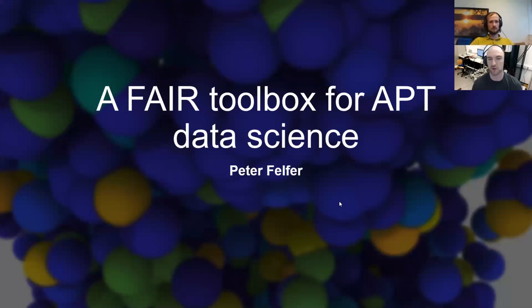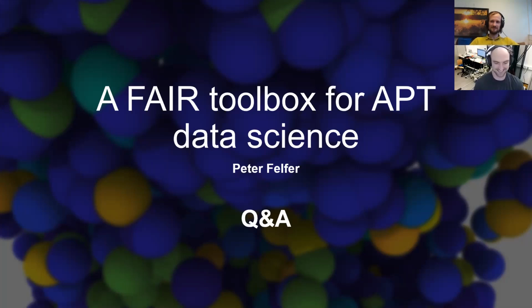Oh, by the way, the code is all available to anyone that wants to use it. I'll give the GitHub link. We will publish something about it, but if you're interested already, you can go on it. It comes with all kinds of tutorials and MATLAB live scripts that just explain everything and how to use it. My students can by now use it by themselves, so yeah. Great.